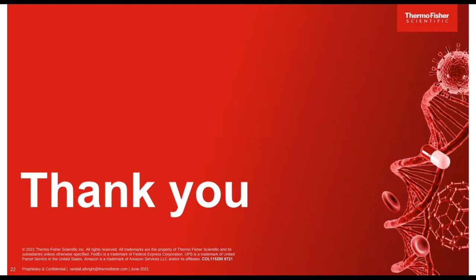Great. We do have another question here. It says, how often should I re-qualify an instrument? This is determined by the manufacturer's recommendation and the risk tolerance of the workflow. Thermo Fisher uses a risk-based determination to make recommendations to requalify. At a minimum, for the LSG instrumentation, we recommend after any move, any PM or planned maintenance, or after any of those critical repairs that I mentioned earlier that would affect data. So that would be the times that you would need to requalify the instrument.